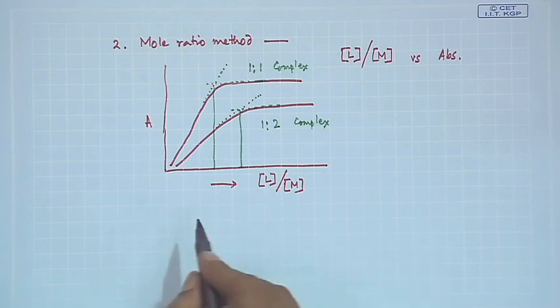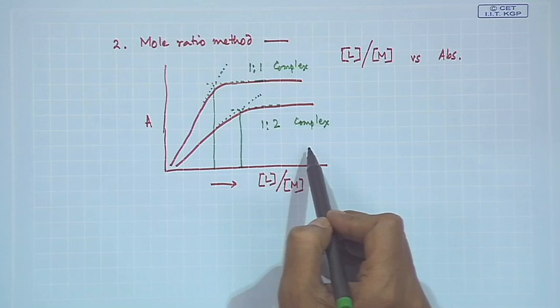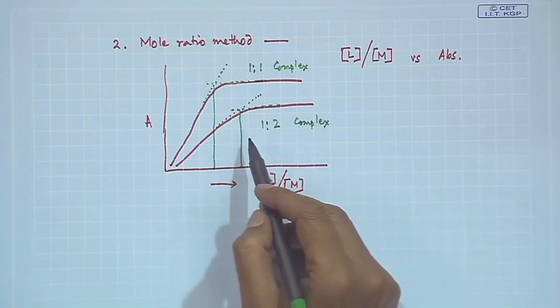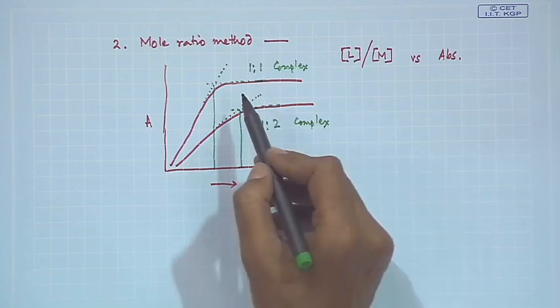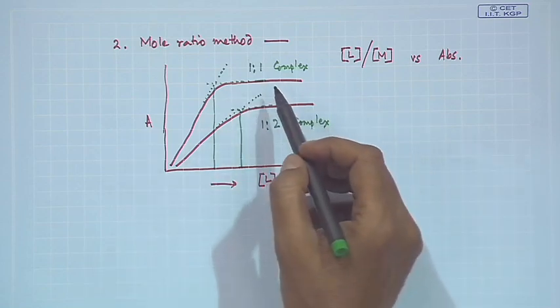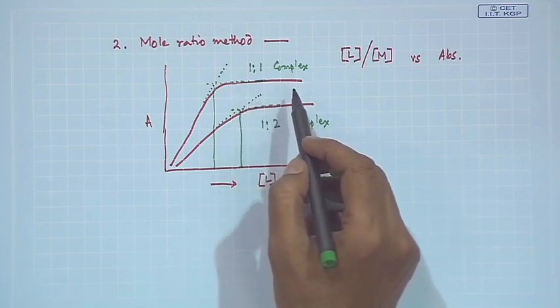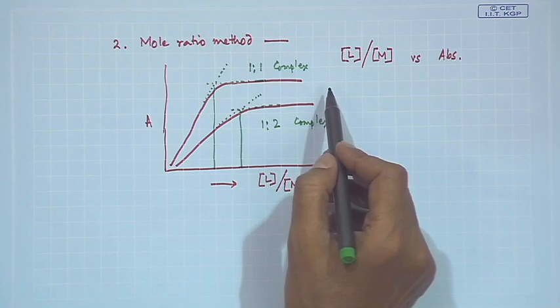So, in all these cases, what we see is which way the corresponding complexation reaction is going. In some cases, the method of continuous variation is useful, as we have just seen, and we can determine that for a 1:3 type of complexation the mole ratio is 1:3.